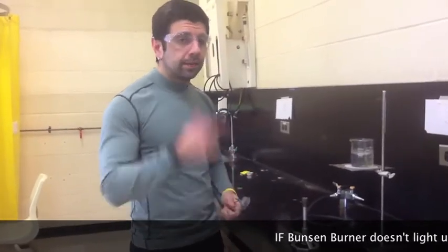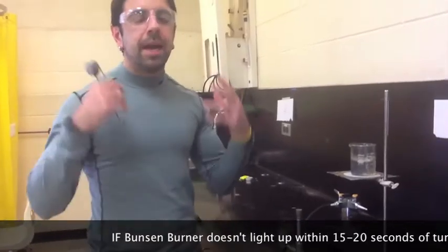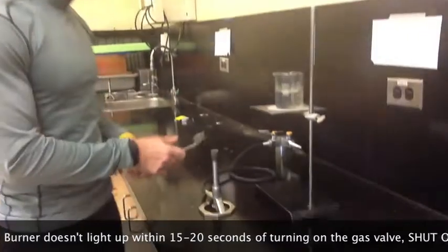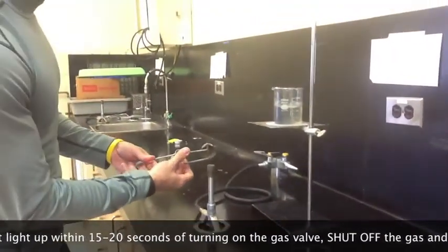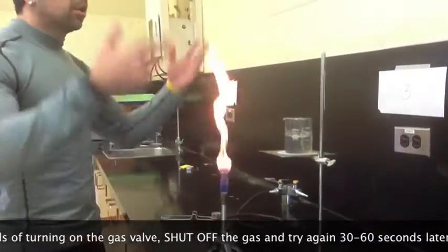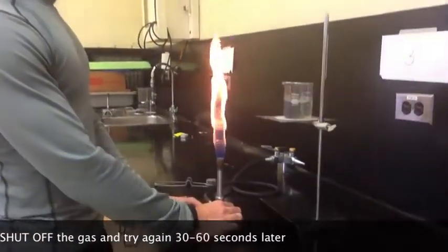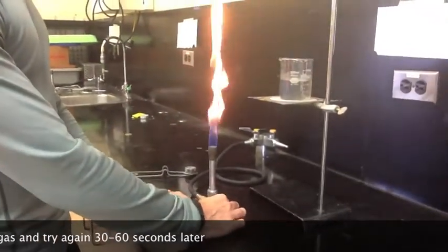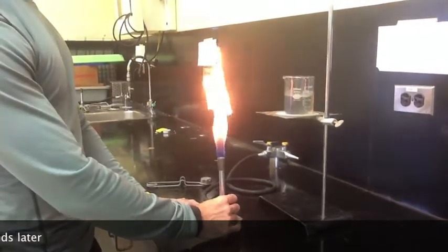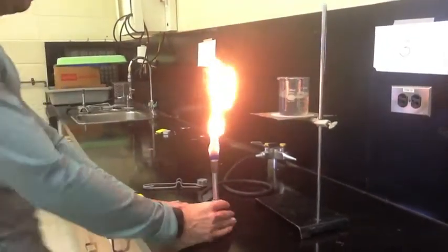Again, for safety reasons, because we are using a Bunsen burner, safety goggles a must, hair tied back. We're going to turn on the gas. You're going to hear the hissing sound. Light the Bunsen burner. Notice here, quite the flame, very uncontrollable. So we want to control the amount of gas going through as well as the amount of oxygen. We want to try to get a blue flame.